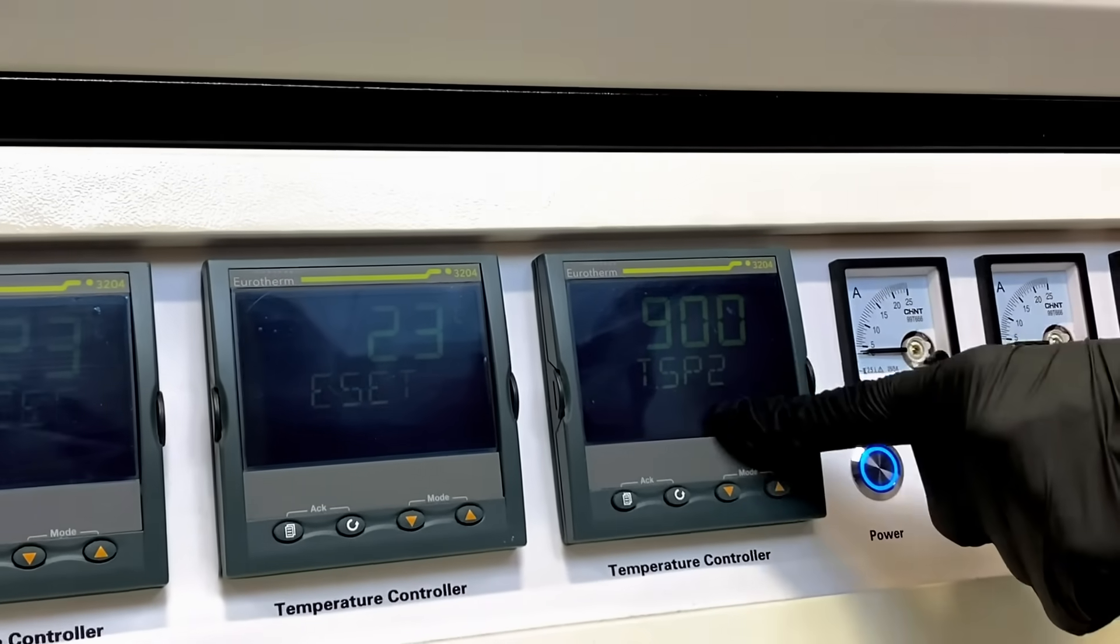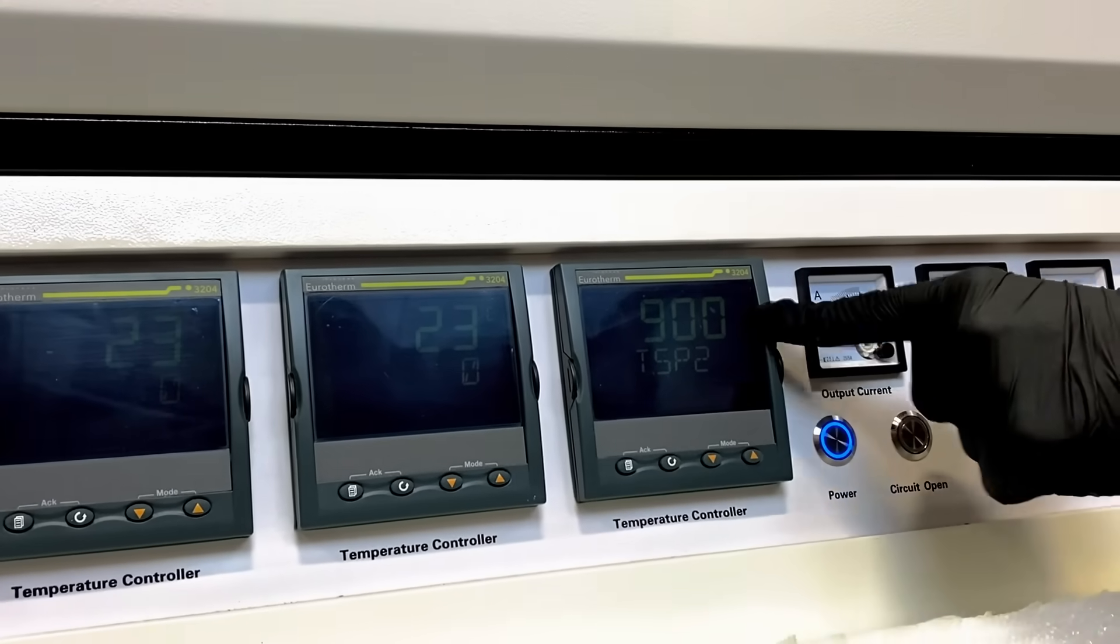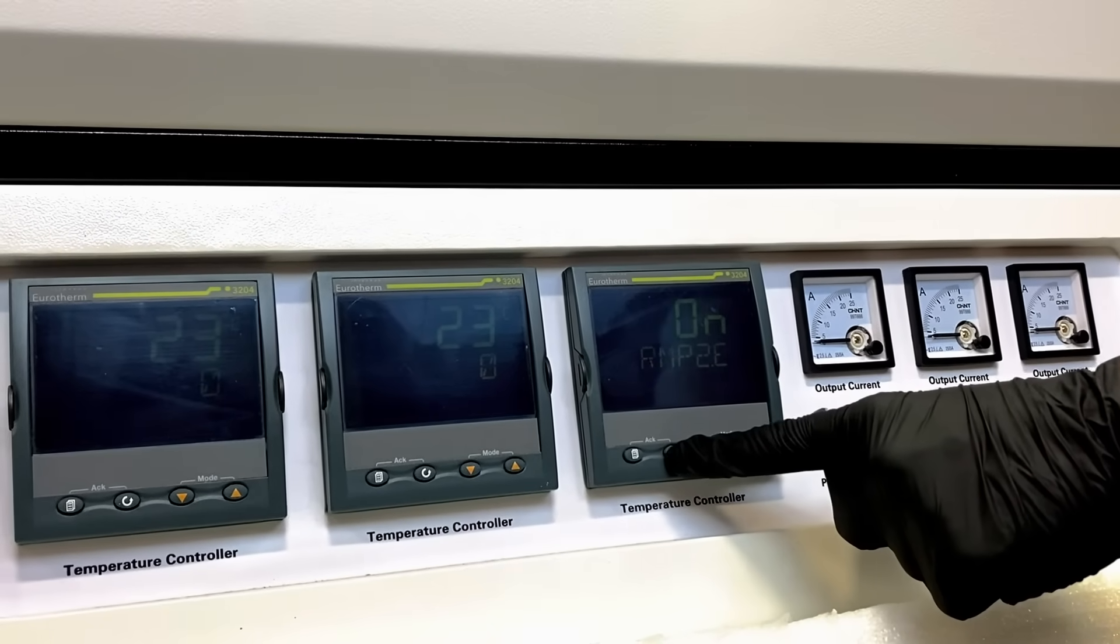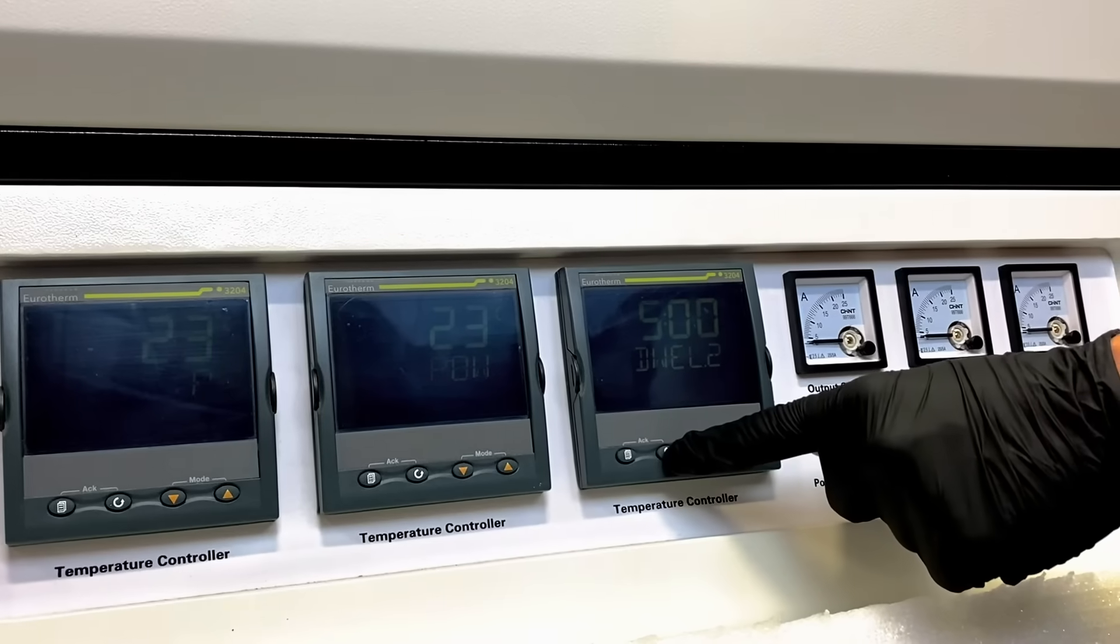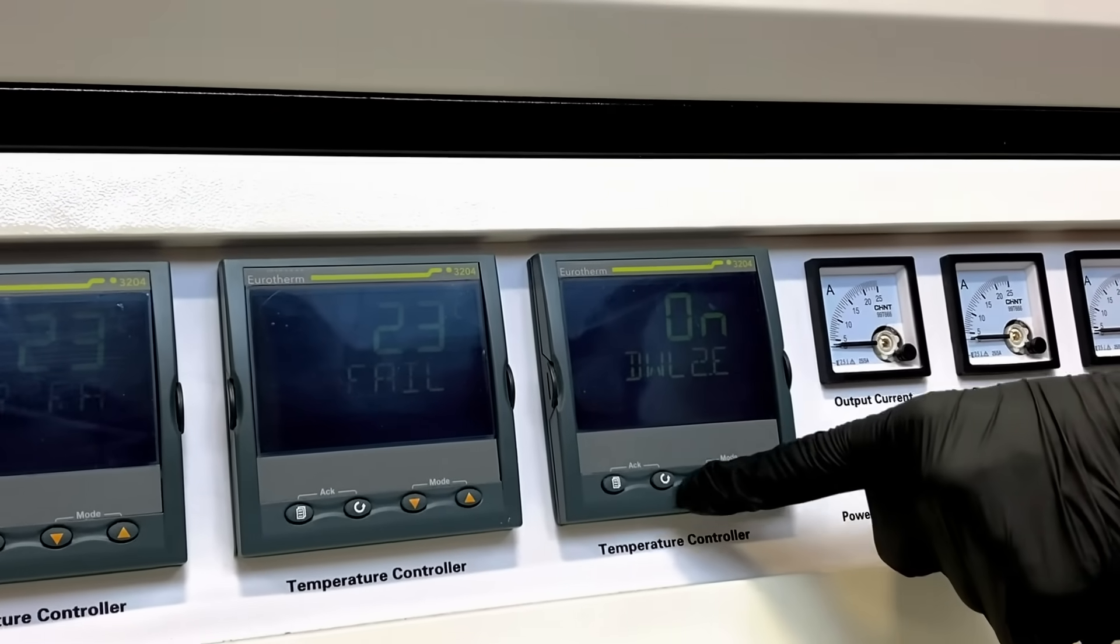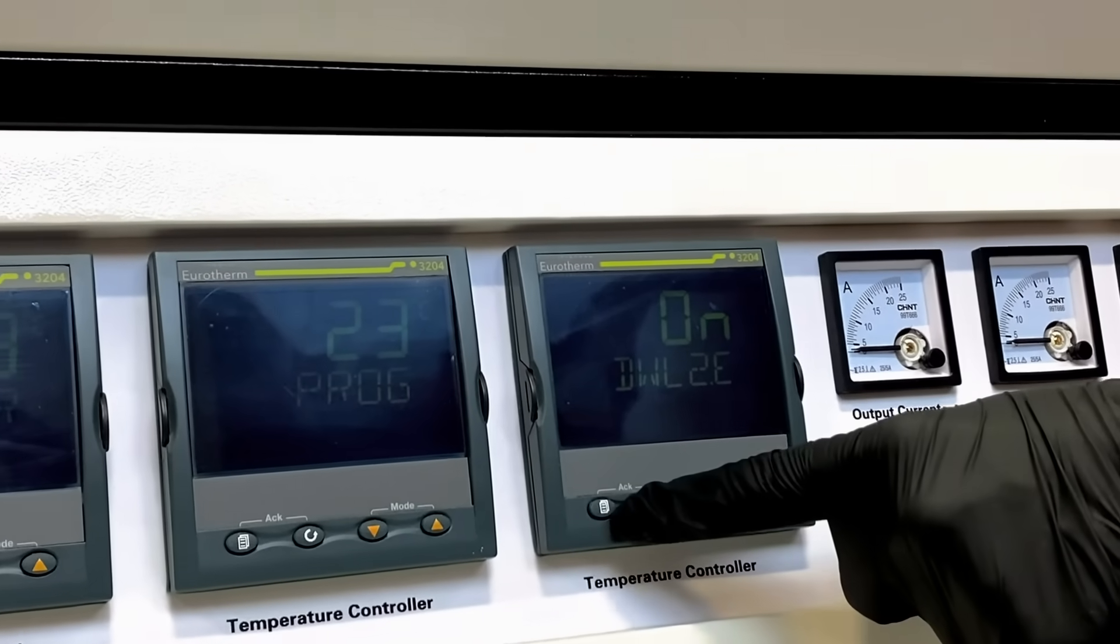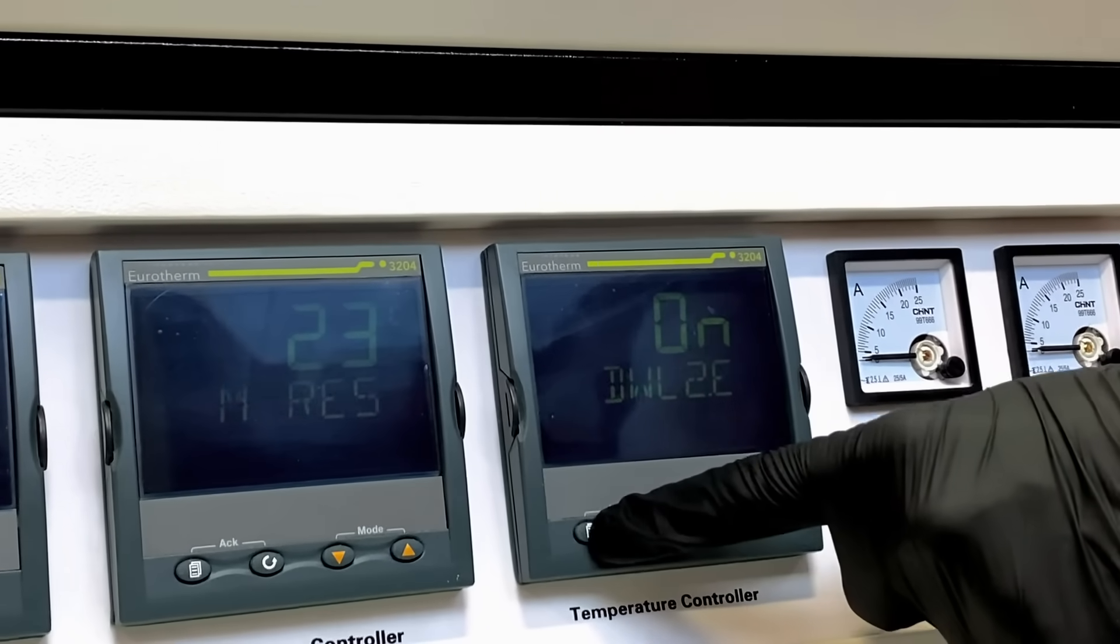Our second temperature set point, we have set to 900 Celsius. Again, we may accept. The ramping cycle is on and so on. To accept your program, press the leftmost button.